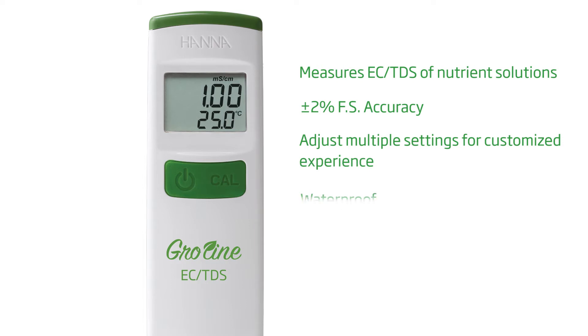this advanced waterproof tester has more features than any other comparable meter on the market and is perfect for growers who need to check the conductivity and TDS of their nutrient solution.